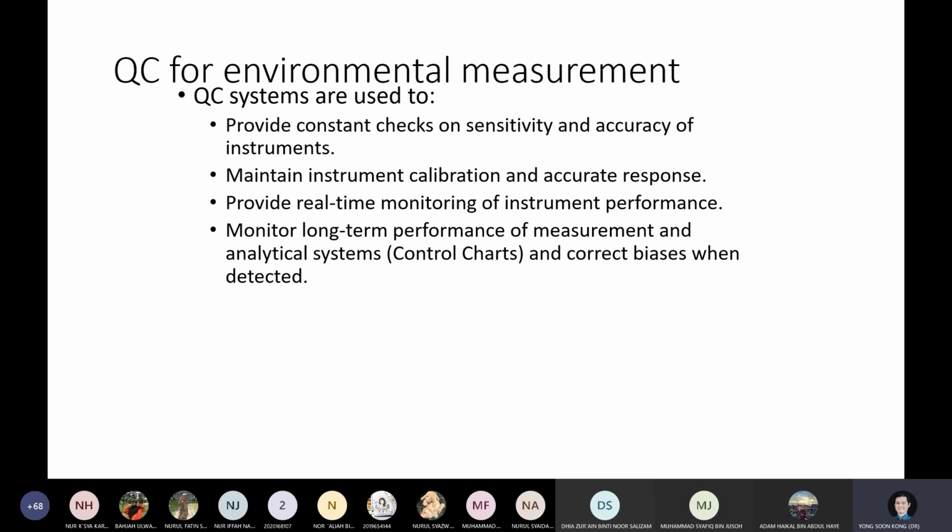Although in this slide they say that instrument is what they look at, because instrument is used to measure. Now, in order to have confidence in those measurements, you have to know exactly that if they measure A, you are expecting to get A result. That is what you get from what we do on calibration.